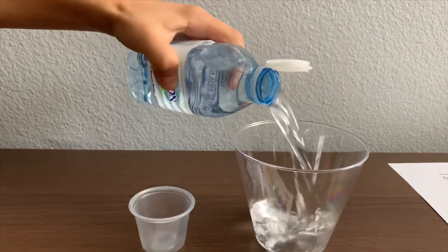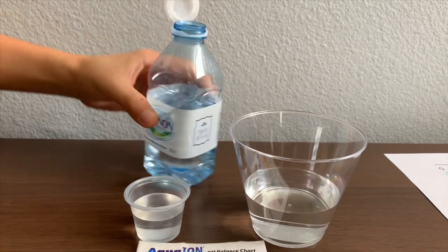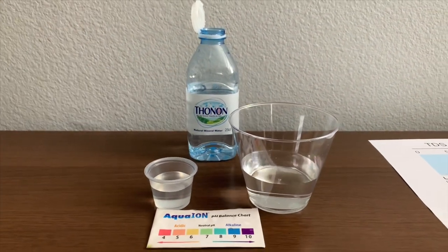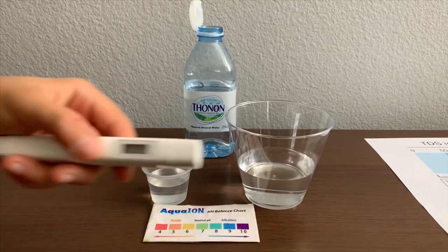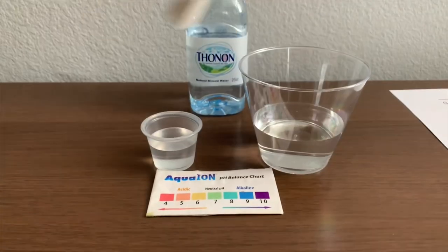Let's pour some water in. First, let's test the TDS level. Turn on the TDS tester, make sure it says zero, and put it in.